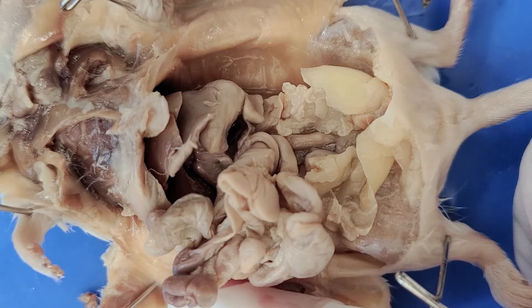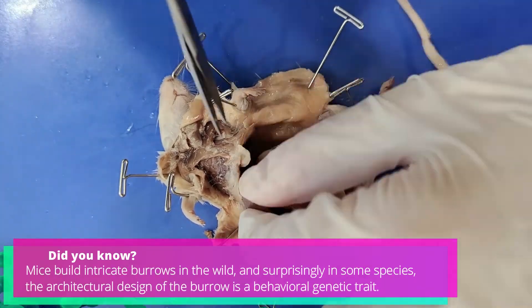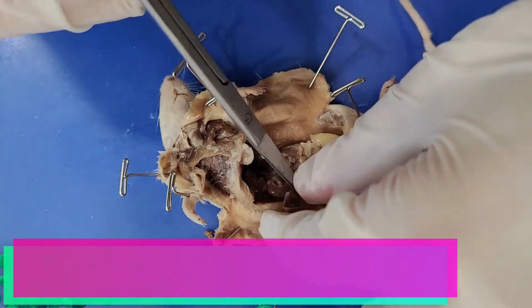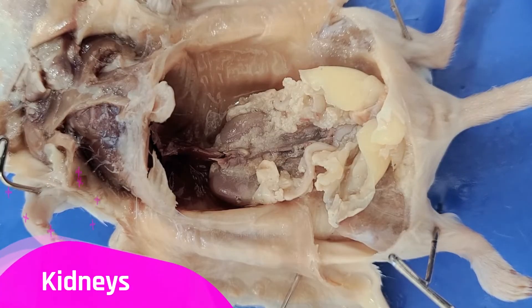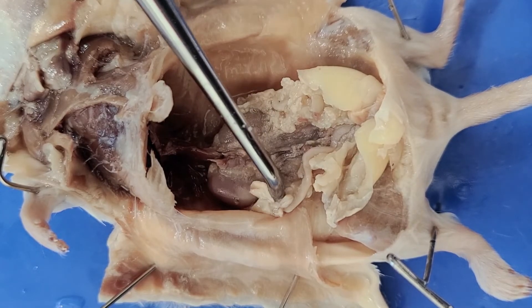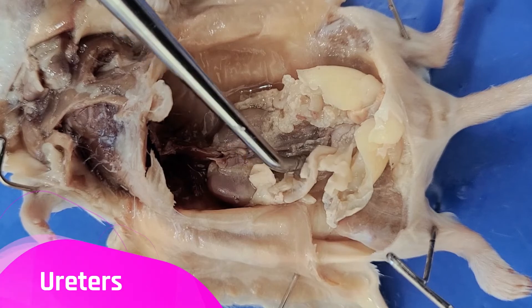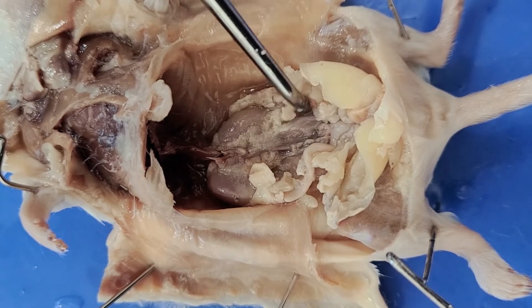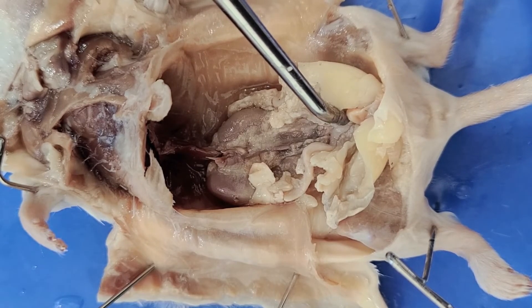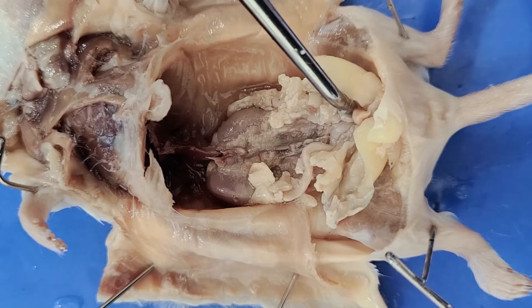Now I'm going to cut out these digestive organs so that we can take a closer look at the kidneys. The kidneys are these bean-shaped structures that filter the blood and produce urine — here's one on this side, and here's another on the other side. Descending from the kidneys, you can see the ureters, one tube here and another on this side. The ureters transport the urine from the kidneys to the bladder, which fills up with urine and stores it until it's ready to be excreted via the urogenital opening. The bladder is bigger when inflated, but right now it's deflated.